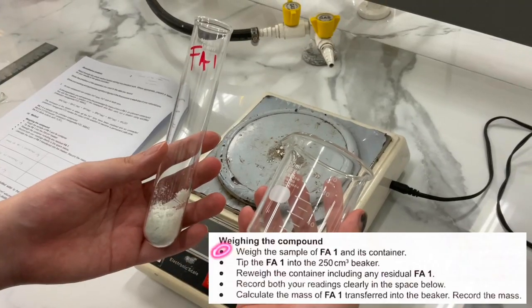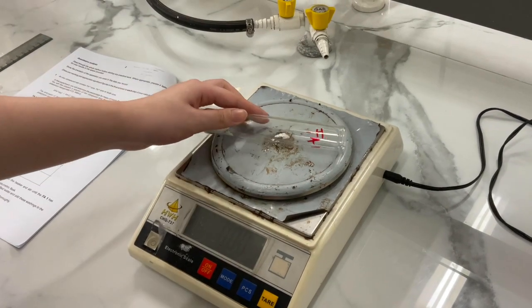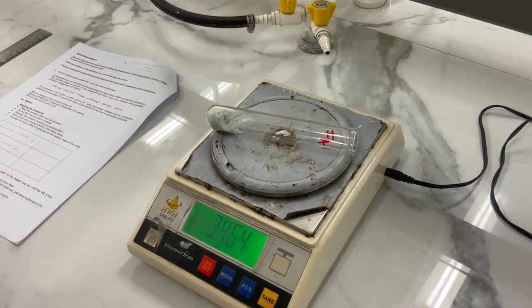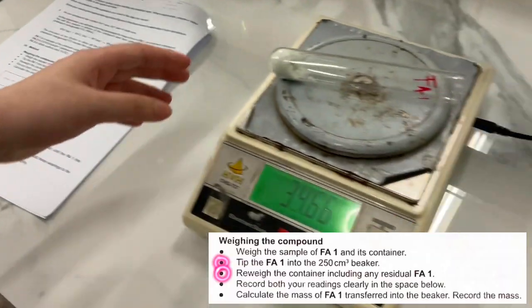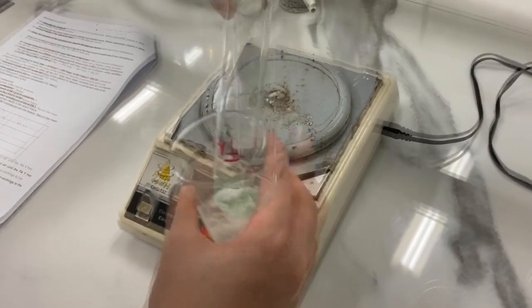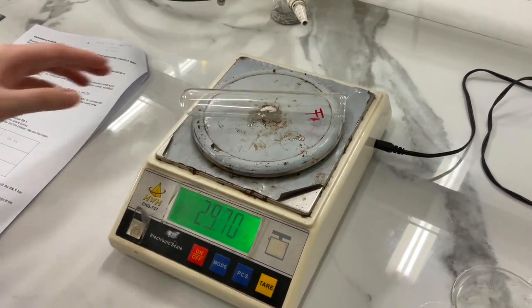The first step is to weigh the sample of FA1 and its container. Don't forget to tare the weighing scale and wait a few seconds for the balance to stop wavering before you record the mass. Then, tip the FA1 into the 250 cm³ beaker, re-weigh the container including any residual FA1, and record its mass.